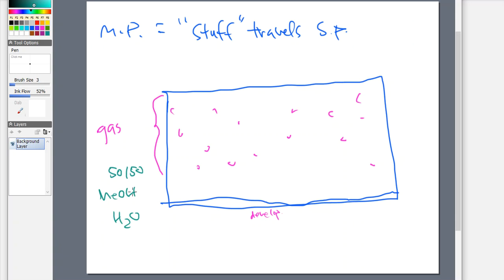That's pretty standard. As I'm waiting for 20 minutes, there is a chance that my methanol, because it is very volatile based on how it's built, is leaving that water. There's a chance that it's going into the upper realms of the TLC chamber.